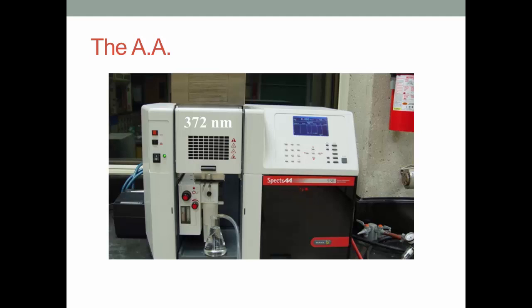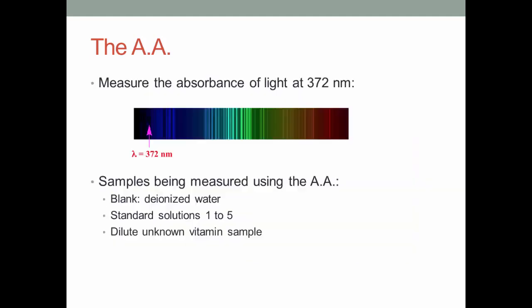Now we will be using the AA spectrometer, which is the machine you see here. The AA will measure the absorbance of light at 372 nm. The samples being measured will be a blank containing deionized water, the 5 standard solutions, and the diluted unknown vitamin solution.